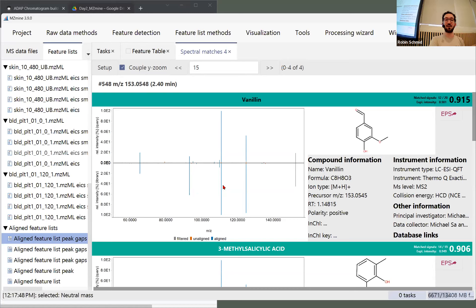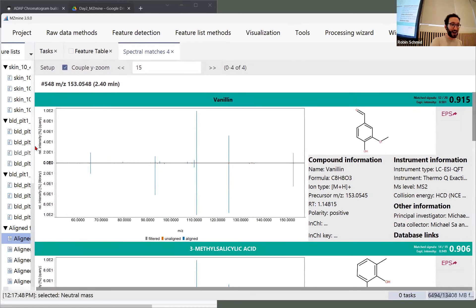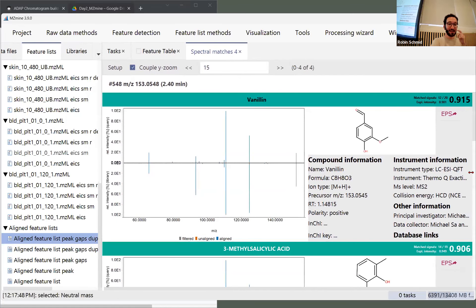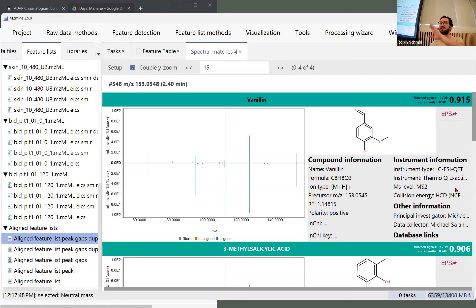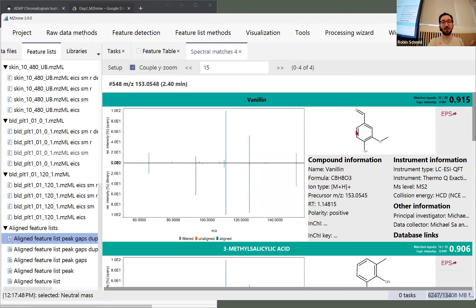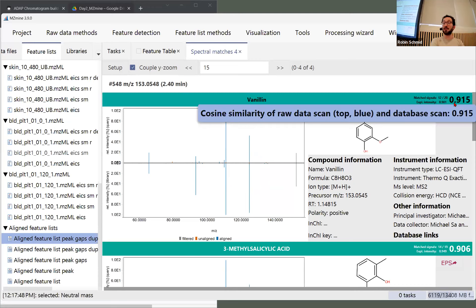Right-clicking on a row with a match and clicking show opens a dialogue with spectral library matches. On the bottom there's the reference data from MoNA — Mass Bank of North America — LC-MS/MS positive. On the top we have our own spectra. We can look at some metadata like the collision energy and who submitted the spectrum, then compare with the collision energy used for our sample. The most important score is the cosine similarity — the default weighted cosine similarity — where one is identical, close to one is very similar, and zero is completely dissimilar.